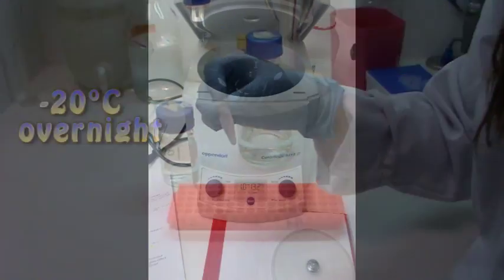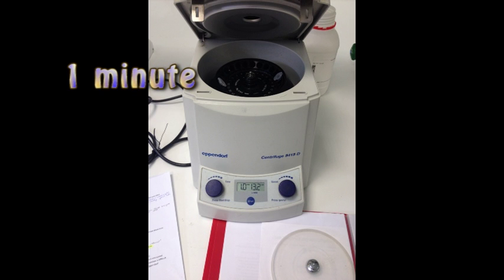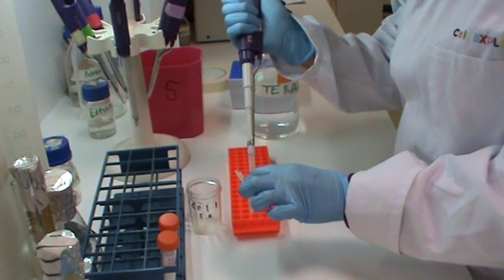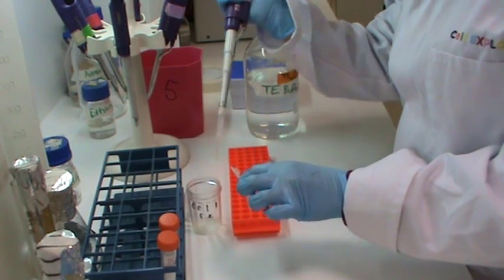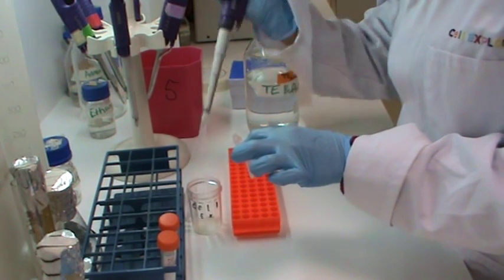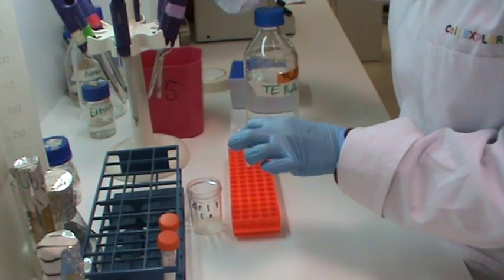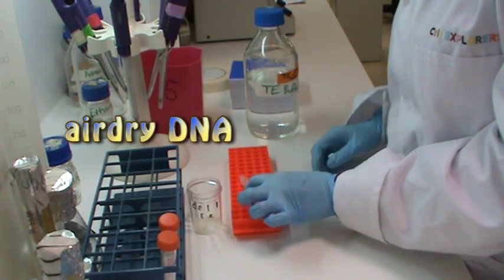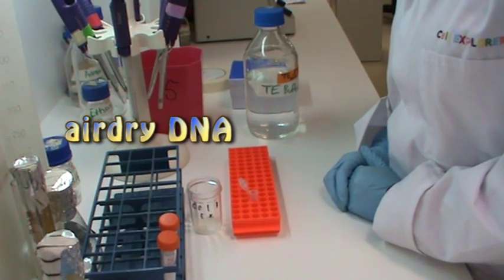I am now going to centrifuge the microfuge tube for one minute to pellet the DNA. I am now removing the supernatant. I am then going to leave the DNA to air dry for a couple of minutes.